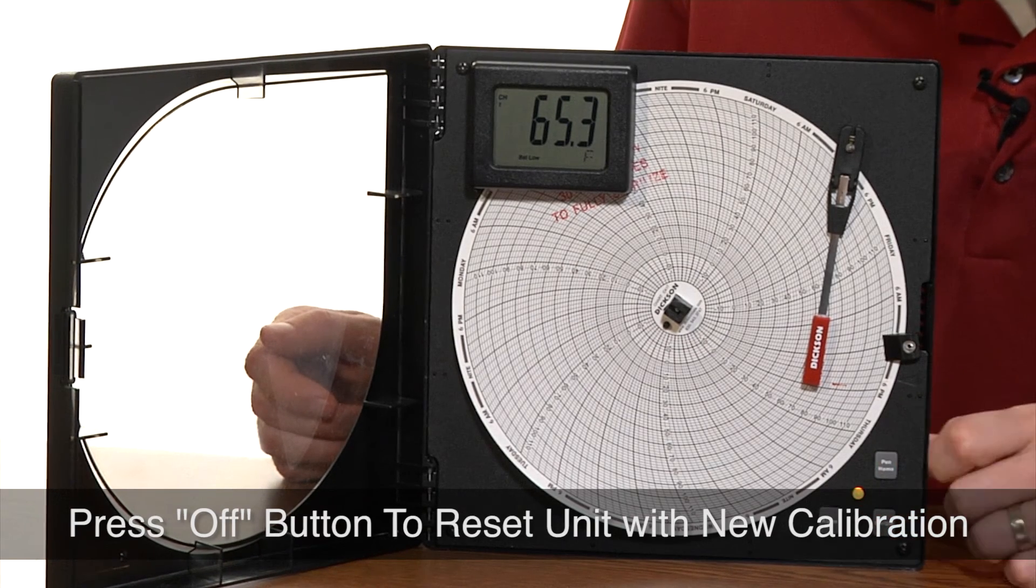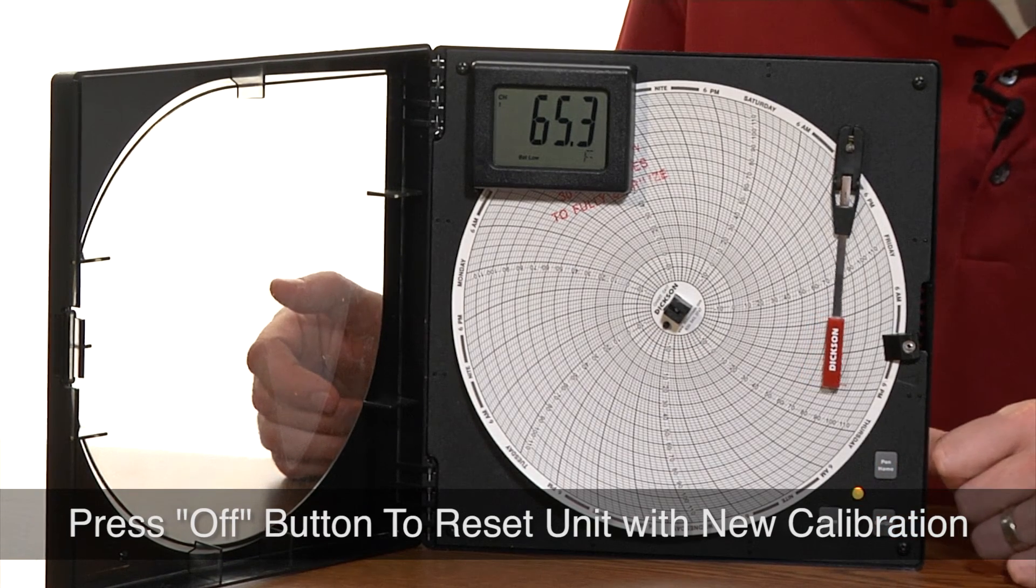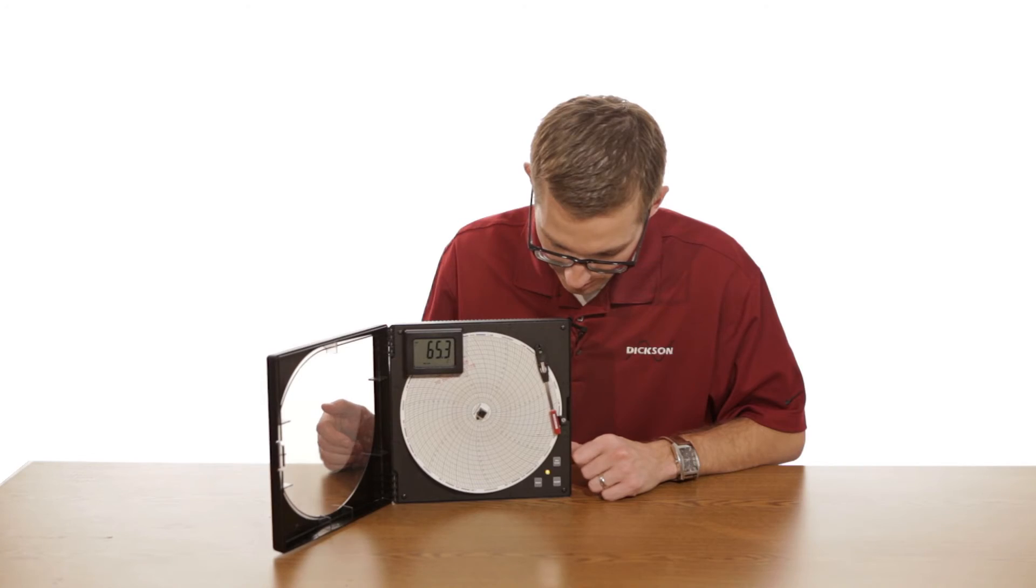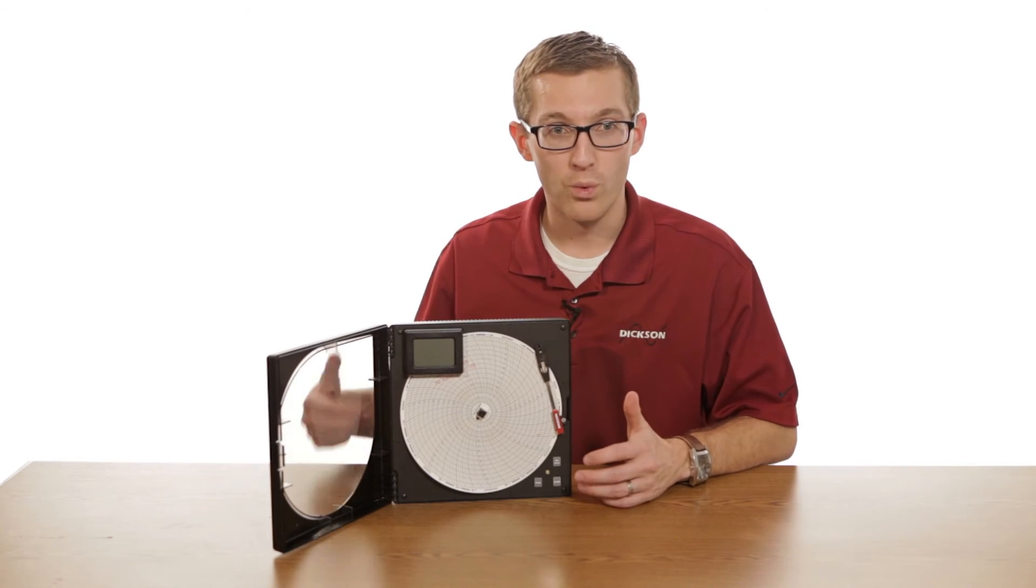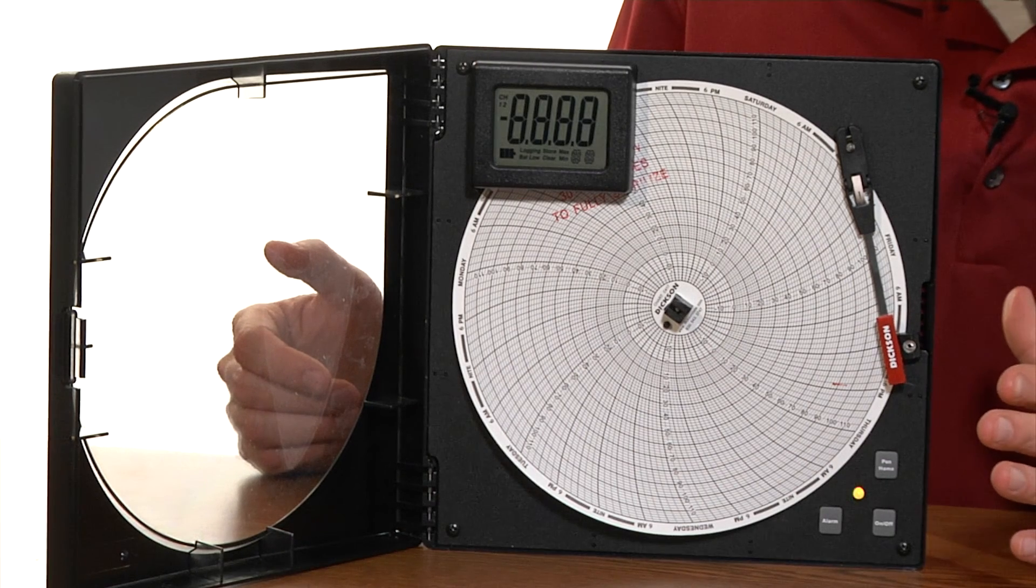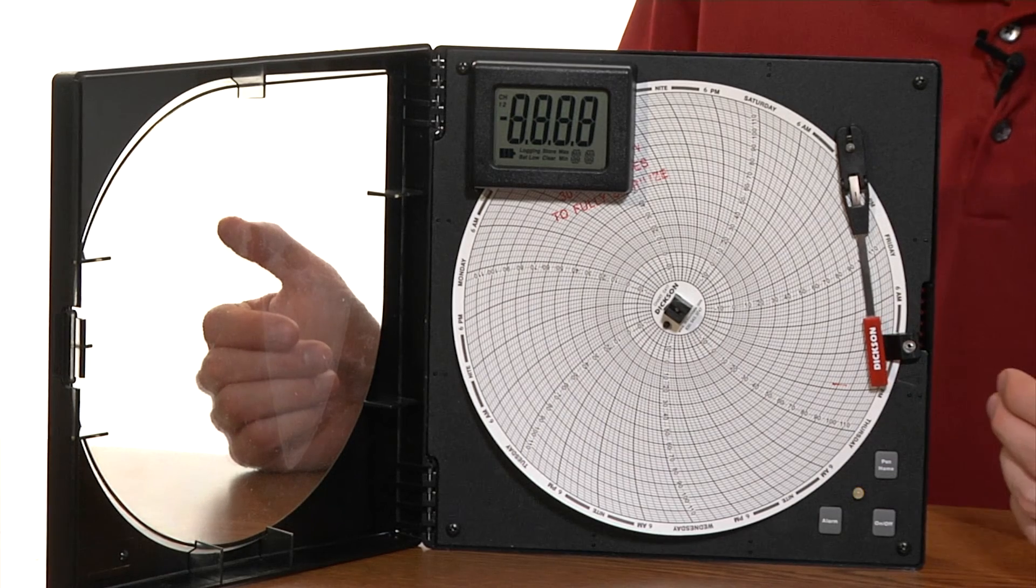...go ahead and press the off button. The unit is going to move all the way to the left and we're out of calibration mode. When you turn the unit back on, just hit the on button and the unit is going to move the pen back to where we calibrated the unit to.